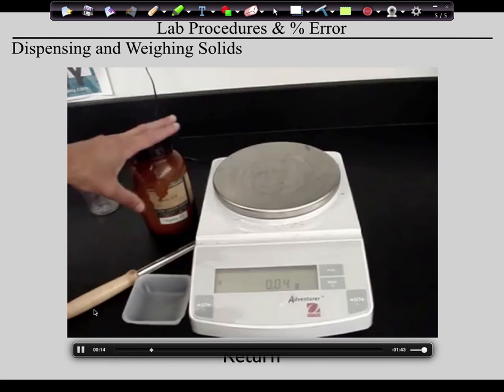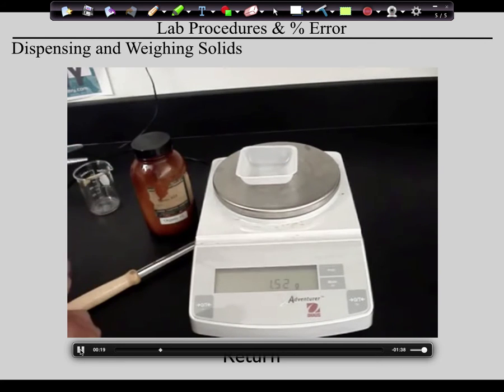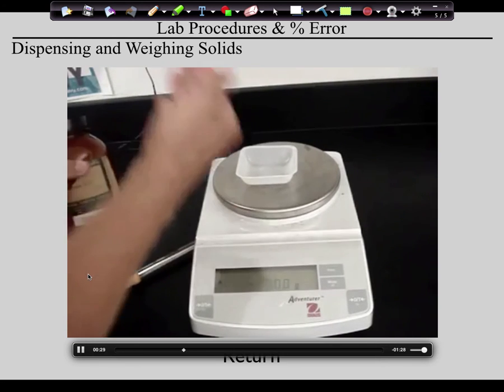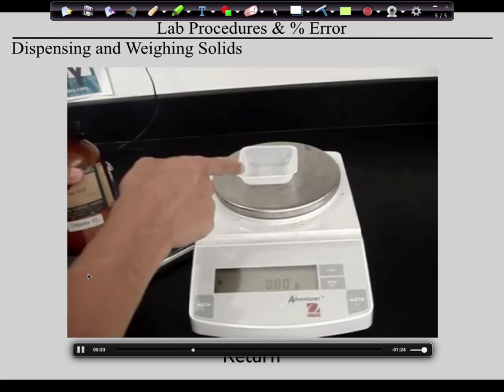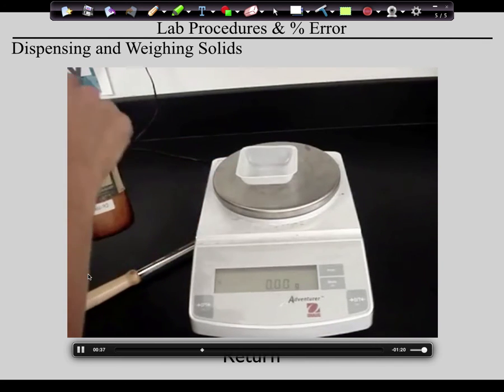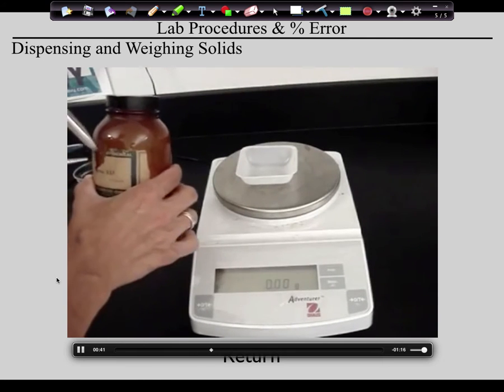Let's say I was measuring 2 grams of sugar. Well, I would first use a beaker or a weighing dish, put that on. Now I don't want the mass of that dish, so I'll hit the tare button. So it says 0. And now I want to put 2 grams of sugar in. Now it's very important that I don't go over, because remember, as soon as that chemical hits another container, I consider it contaminated. So if I put more than 2 grams in, I can't just scoop it out and put it back in this bottle.